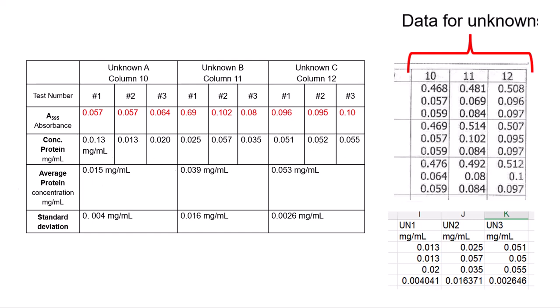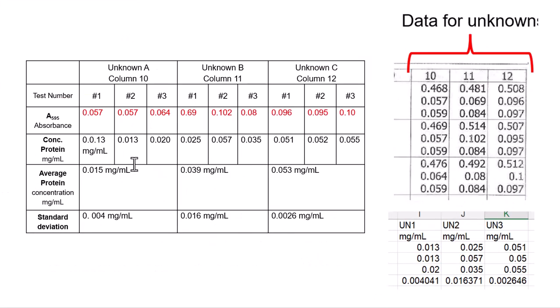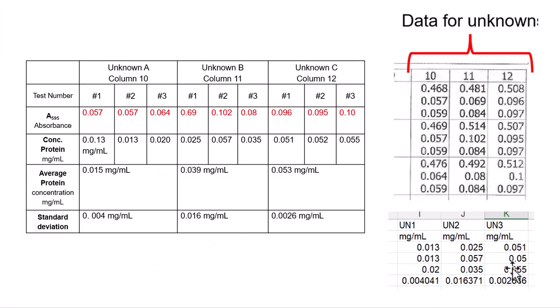And then from our calculations, we saw that we had this average. You could use either. And that's what's going here. And then the standard deviation is what we also could put into an Excel spreadsheet, if you remember. So here's this data here. See this, where this data was put into the column.